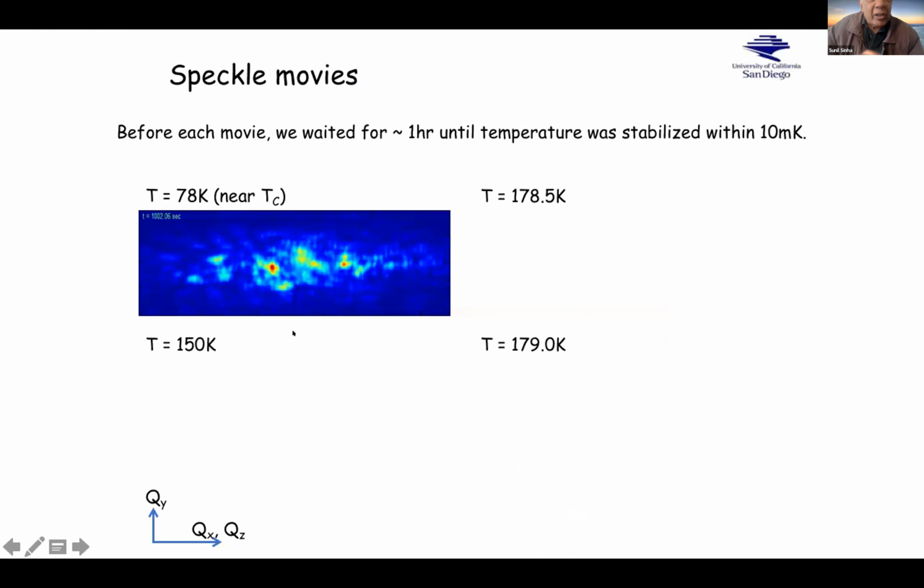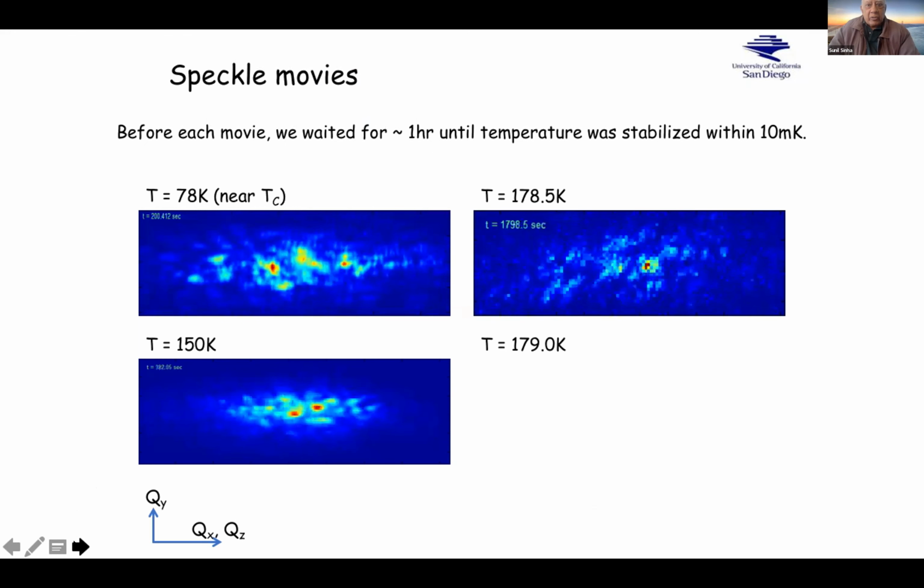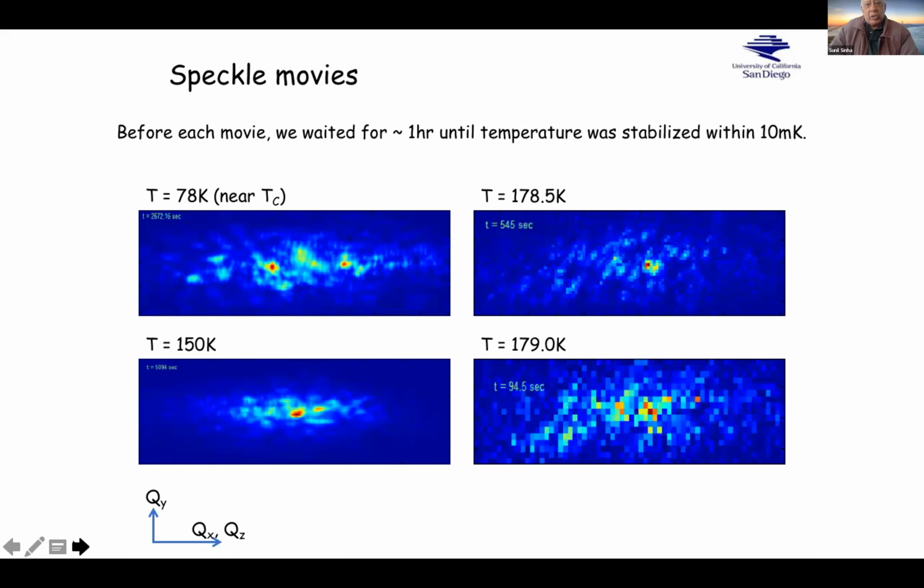Here, and this is for the first time, a magnetic experiment with XPCS and grazing incidence. This is a dysprosium film. We're looking at the fluctuations of the speckles above the Néel temperature of the spiral phase. It goes from a paramagnetic phase to a spiral phase. And you can see that as you go up in temperature, the dynamics of the speckles are more pronounced.